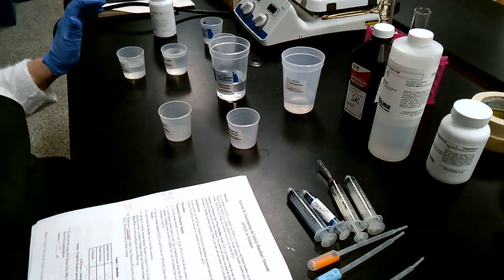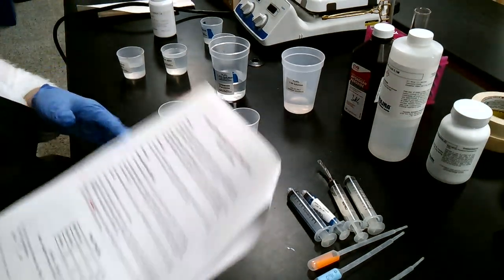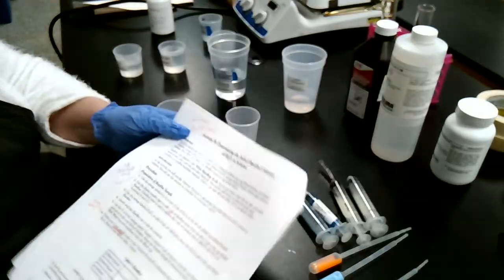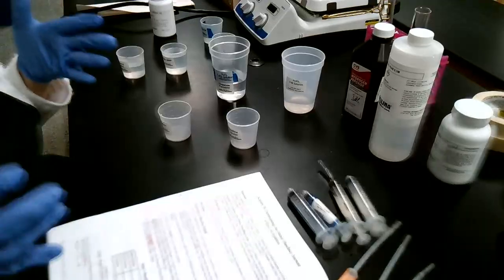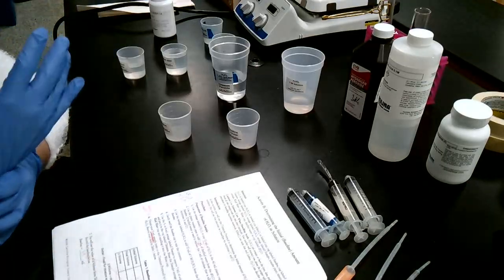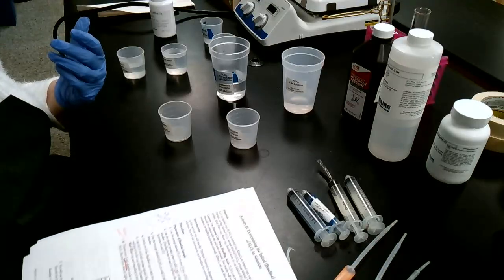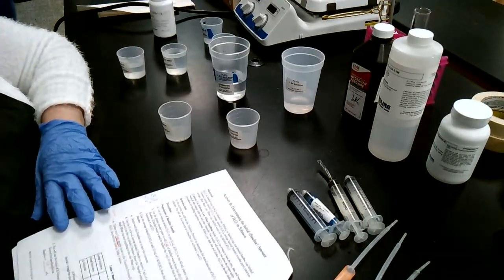Okay, kids, so here I am, and I'm going to try to do activity B. I know I have lots of chicken scratch all over this, but this is going to be determining the initial baseline amount of H2O2 in solution. It's basically your control.